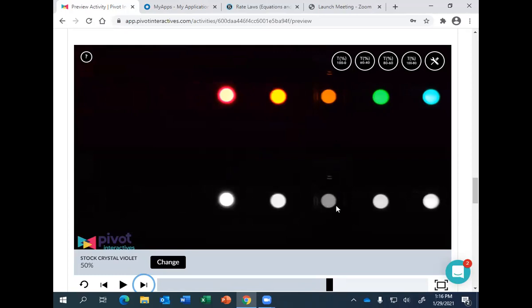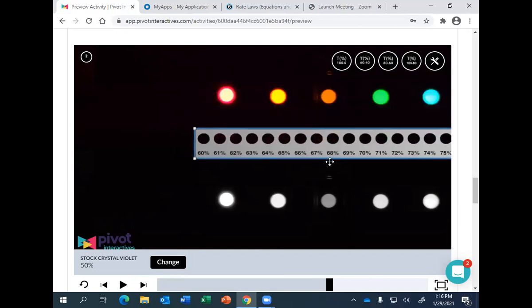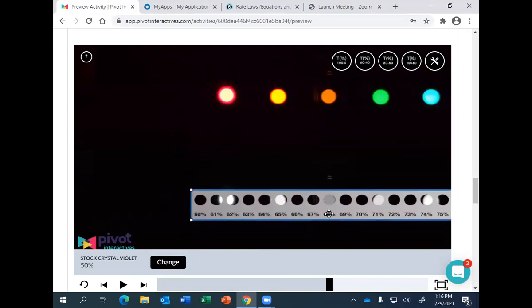This circle down here is going to allow me to measure. This is a grayscale kind of thing, which is going to allow us to measure how much light was absorbed. So let's say maybe we'll try this middle range, 60 to 80%. So I'm going to take this down here. So I'm putting on 68%.